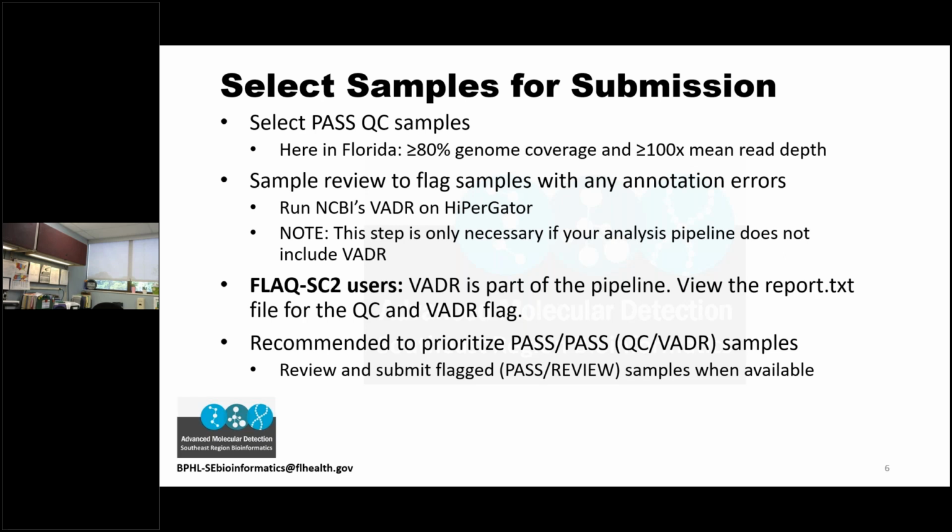But they haven't released that open source, and so that's caused a lot of frustration among a lot of the labs, in that some samples might get accepted by GISAID and not by GenBank, or vice versa. There's been some recent updates that I'll discuss that have made this much easier, and there's more consensus among both of the databases, so that you're almost guaranteed that if you screen something and submit it to GenBank, it will be accepted by GISAID.